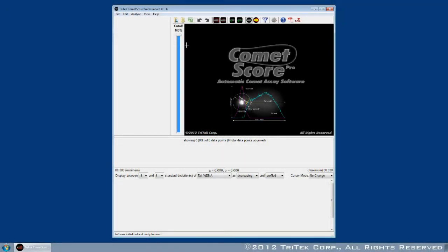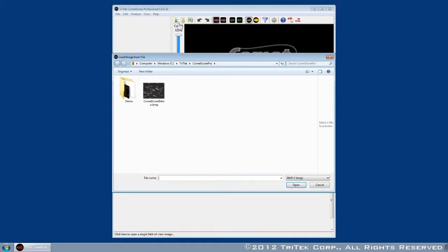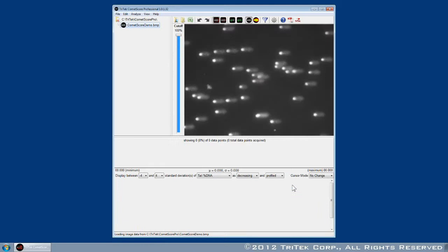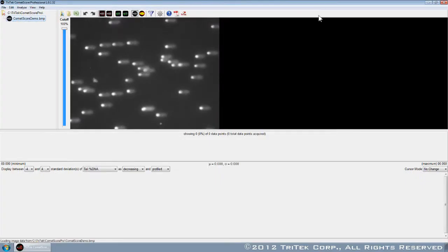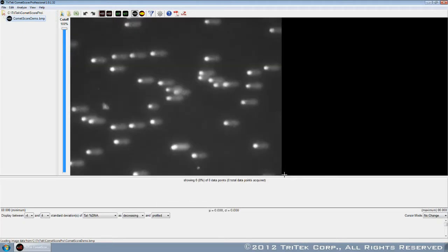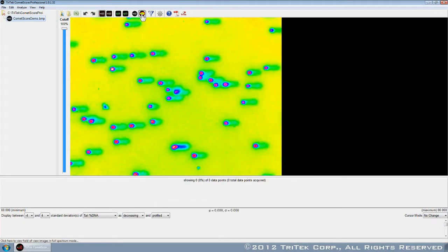CometScore Pro offers a range of easy-to-use scoring options, from the classic manual scoring technique to fully automated analysis of an entire folder of images. You now have complete control over how much of the process is automated and how much is done by hand.